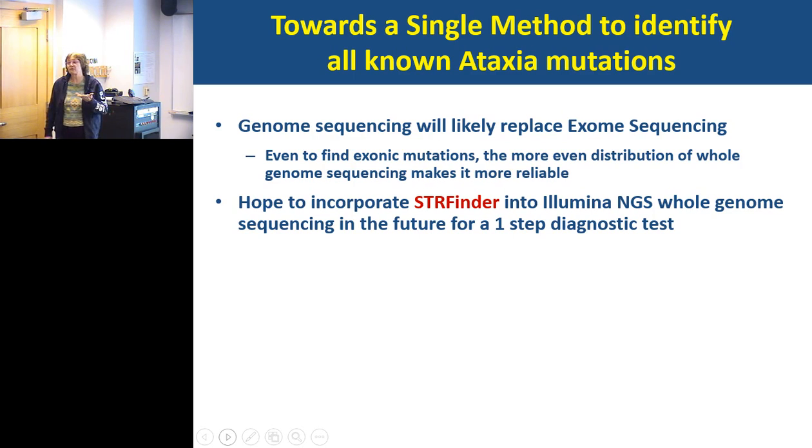This is like 20 or 30 or 50 maybe. But not all of the repeat-containing ataxia genes are CAG repeats. It's the most common, but there are CGGs, CTGs, and also a small number of 5-base repeats and 12-base repeats. So it's not all coding region and it's not all just CAG, and I wouldn't limit myself to those. But we can still make a list of all known ataxia-causing repeats of any kind and look for those. So this method would look for known genes.